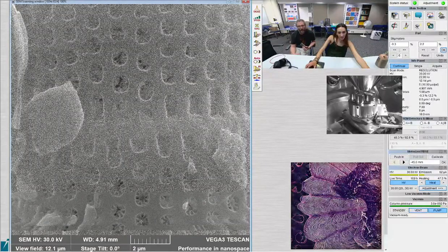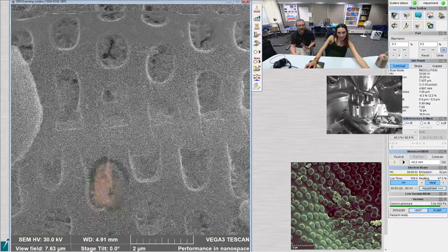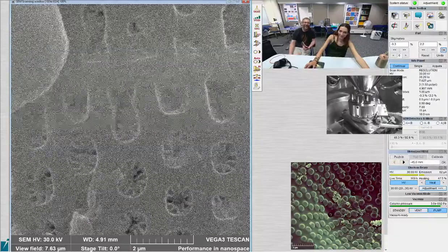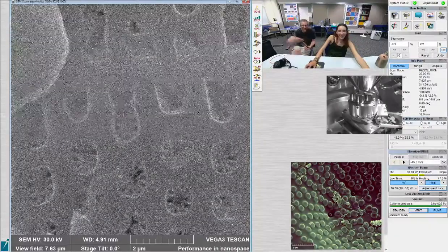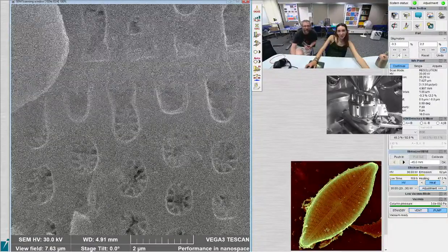But you can pick. Your pick. Get the one that you like the best. Well, this one looks like a fish, so I like it. That's perfect. Also, you can see the spine connectors here as well, so you can get it really sharply into focus.